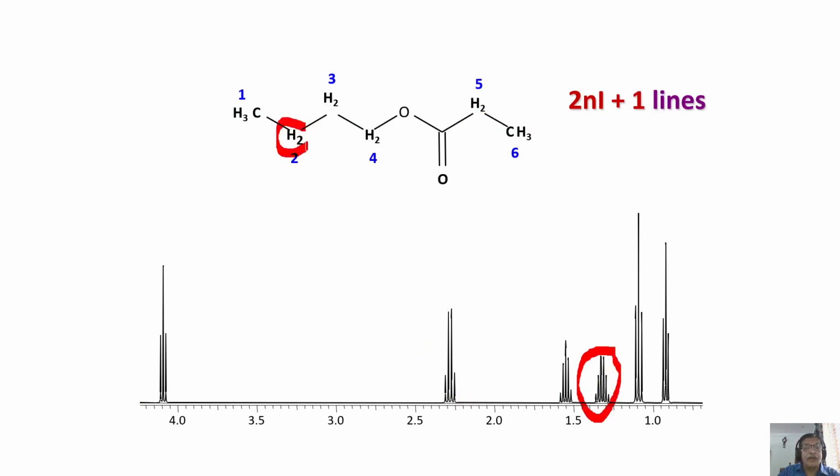If you look at this proton, this is coupled to this and this, CH3 and CH2, the quartet of a triplet or triplet of quartets depending upon the coupling strength. Whereas look at this one, it is coupled to only two CH2s, this and this. It is triplet of triplets. Triplet of triplets maximum you get 9 lines. Quartets of triplets you get 12 lines. So complexity is more here. So I would safely say this is this CH2. And I would say this CH2 is this one.